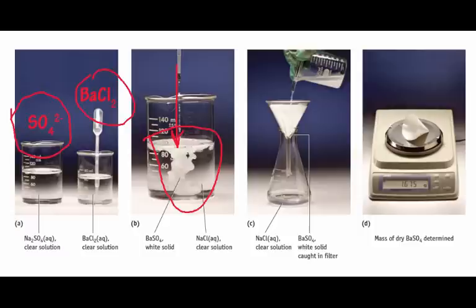And what you see is a precipitation reaction occurring. That white solid is barium sulfate, completely insoluble or very nearly completely insoluble in water.